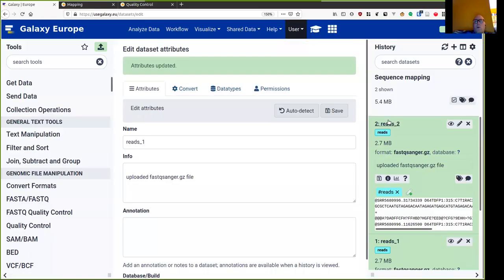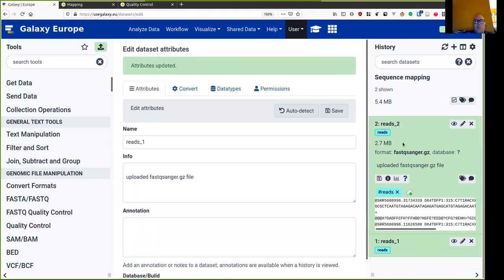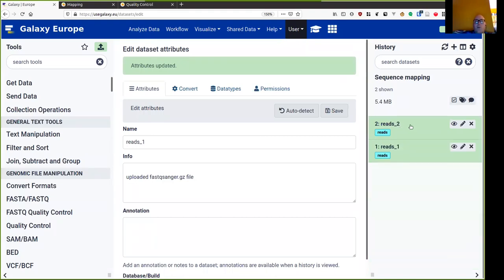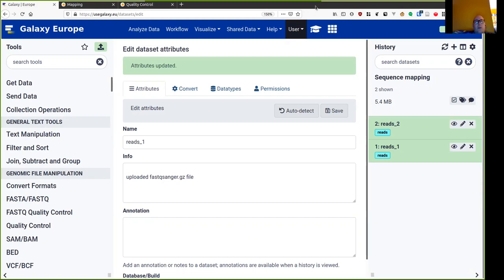When we get data from the sequencer, we typically first perform quality control and trimming before doing further analysis. Galaxy has its own tutorial on quality control, so I will skip that step here, because I happen to know that this is already good quality trimmed data.